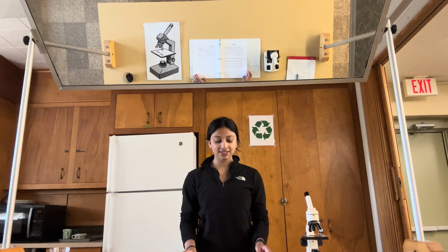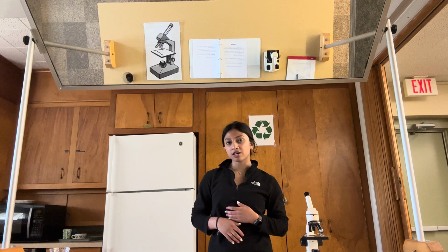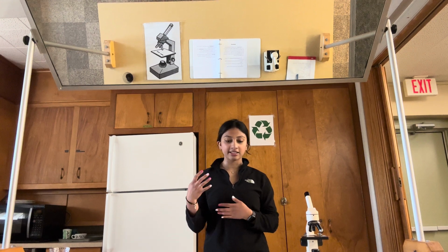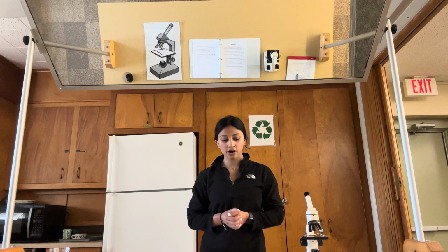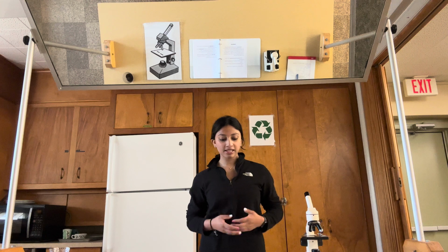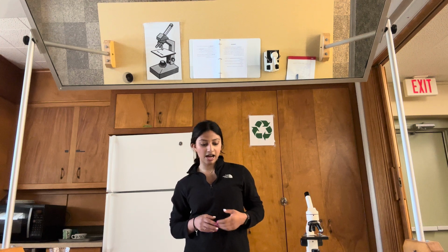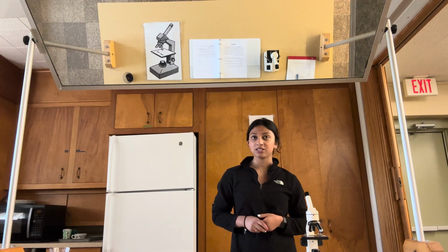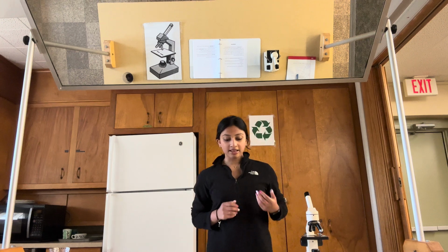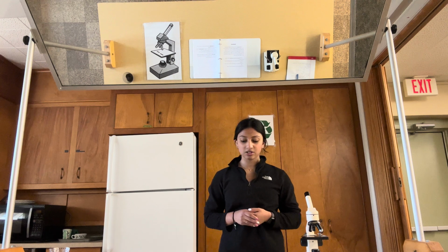Alright, so today's activity, we're going to be exploring the different parts of the microscope and its uses. So first we're going to start off introducing the children and just giving them a background. A microscope is a very powerful magnifying lens. They make tiny objects larger. People use microscopes to see objects that are too small to be seen with their own eyes. As light passes from the object through the lens, it makes the object look bigger.